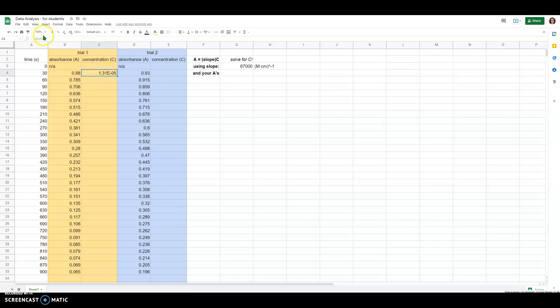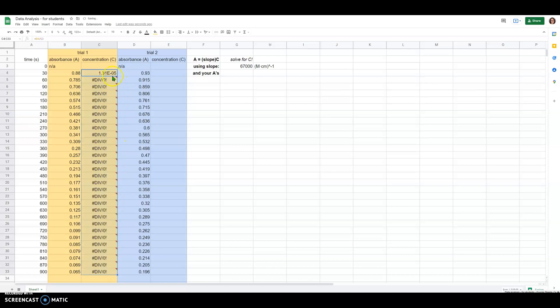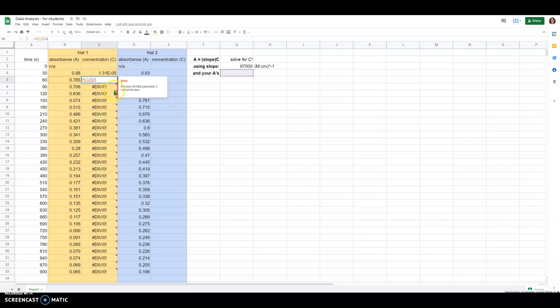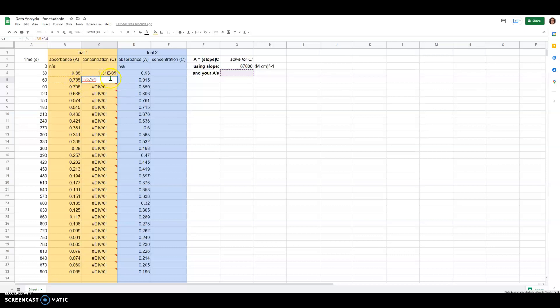That equation is still visible up here. I want to copy it down through the rest of these values, so I'll drag the lower right corner of that cell all the way down. You'll notice it didn't actually work — I'm getting an error. The error comes from the fact that when you copy the equation down, the values used in the equation update based off the new row the equation is located in.